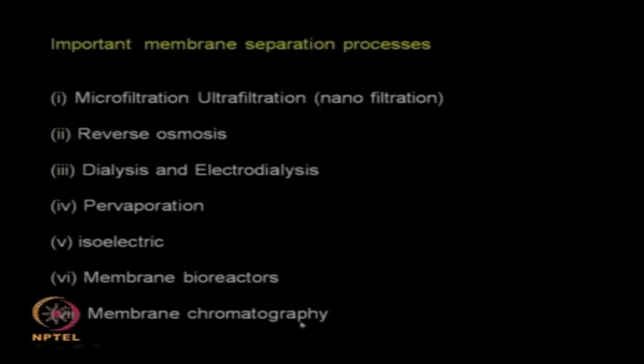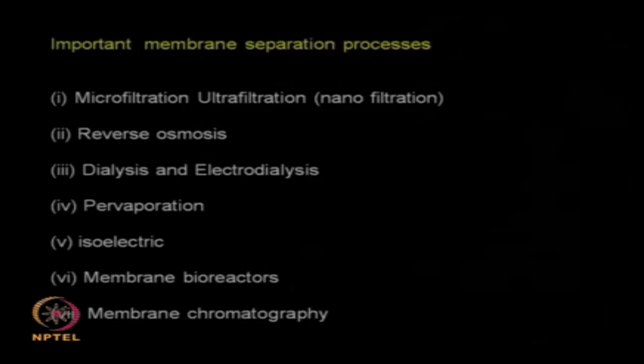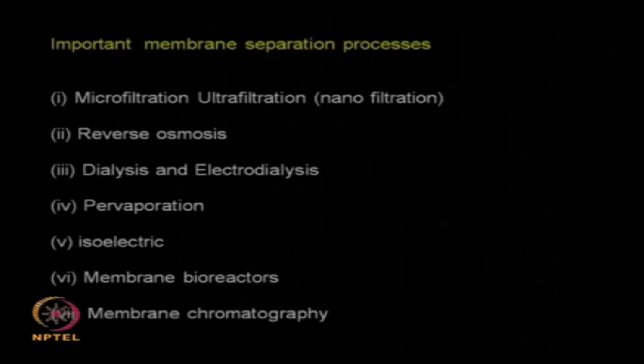Then we looked at membrane chromatography as against the conventional liquid phase chromatography, where you have the ligands covered by liquid. So you are going to have the diffusion slowing down the entire process. The diffusion times are much larger when compared. Here in a membrane chromatography, the ligand is immobilized on the membrane surface, so the diffusions are much faster.